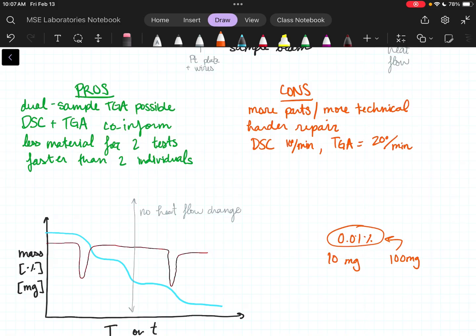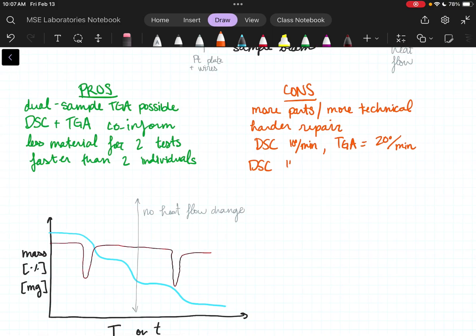So DSC requires that linear rate. Typically the way we handle this is we just run at a speed throughout the whole thing. And we will either let it take a long time because we need the DSC, or we'll let it go faster because we don't care as much about the DSC. And there's kind of just the two sides to that.